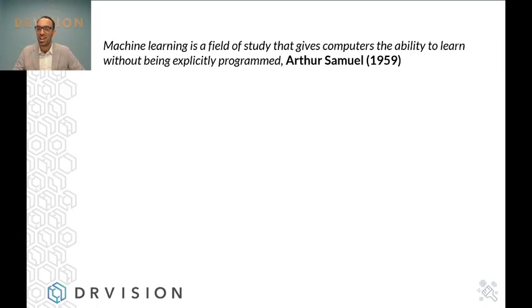Just kidding. But it is very attractive because you can provide lots of data, and the learning architecture that you've defined, of course defined by the algorithm engineer, will fetch the key information and the key patterns in there and create a decision or a prediction based on that.